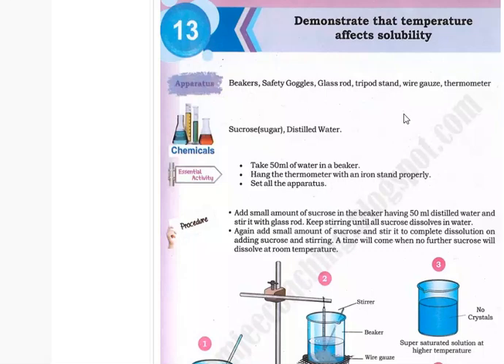Dear students, today's practical that we are going to discuss is to demonstrate that temperature affects solubility. Everyone can observe in his life that temperature really affects the solubility of a solute. To make a solution, everyone knows that we have to add a solute to a solvent.